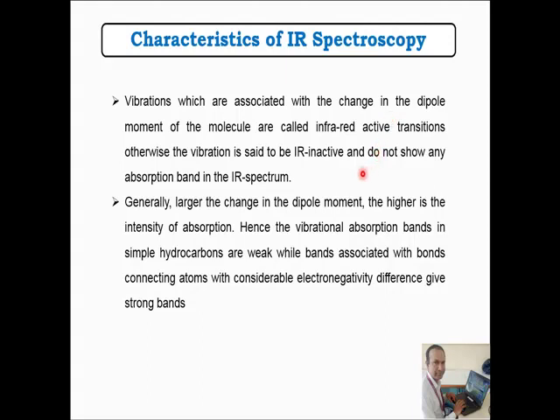Generally, the larger the change in the dipole moment, the greater is the intensity of absorption. Hence, the vibrational bands in simple hydrocarbons like methane, ethane, propane are very weak, while bands associated with bonds connecting atoms with high electronegativity, that is carbonyl or nitrile, give strong bands.